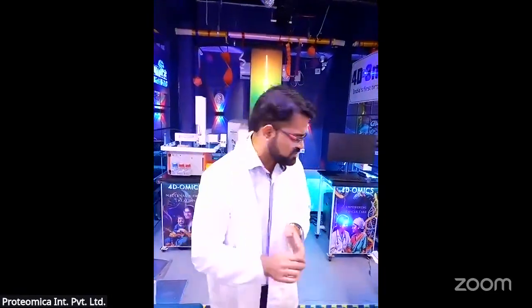There are 2 TIMS attached: TIMS in and TIMS out. From one TIMS, the ions move in and get accumulated, and from the other TIMS, the ions move out. That is why it is called PASEF, parallel accumulation with serial fragmentation. I will not talk more; I hope you have got the basic idea of the functionality.